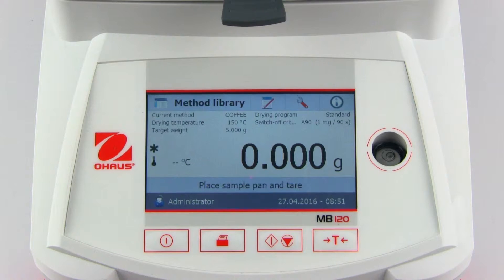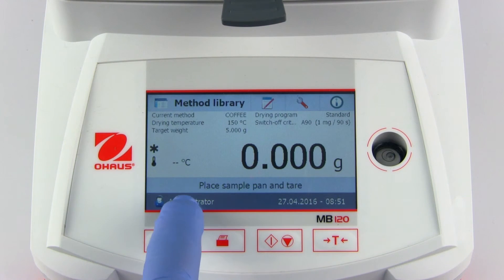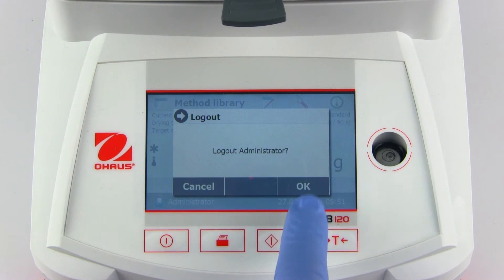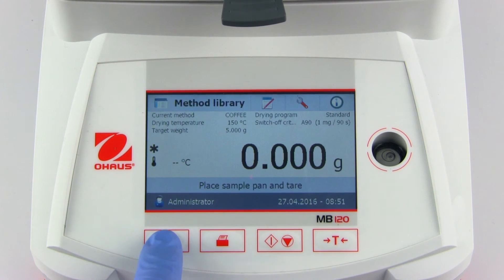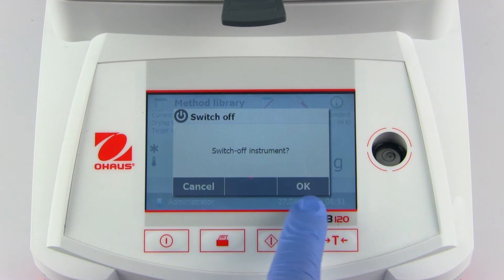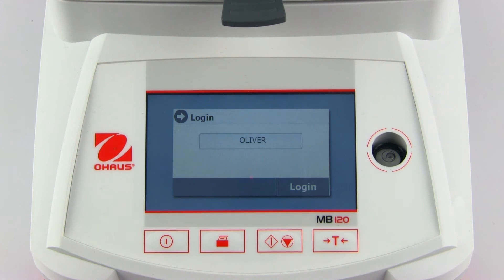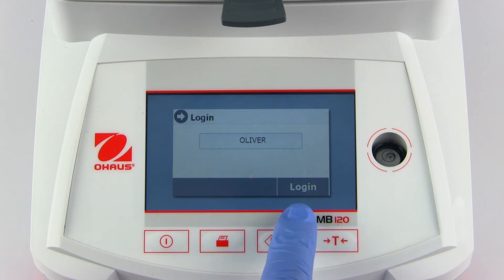To log out, either press the user name in the lower left-hand corner of the home screen, or press the power button to switch off the instrument. To log into the device, select an existing user from the list and enter a password if enabled. In this case, Oliver the operator has no password.